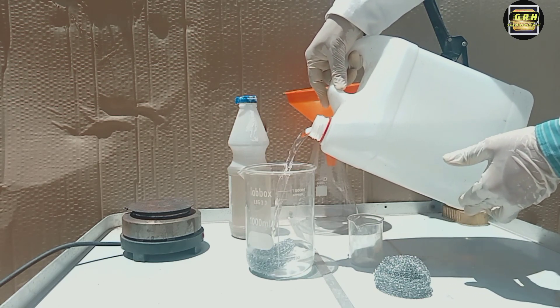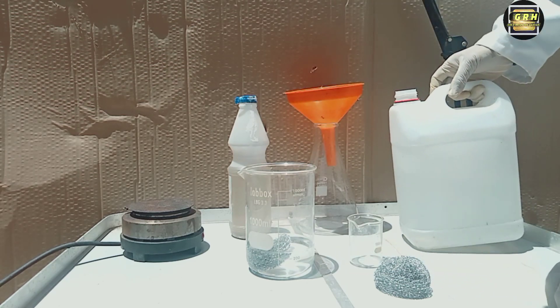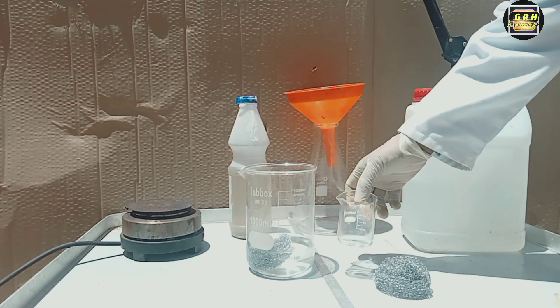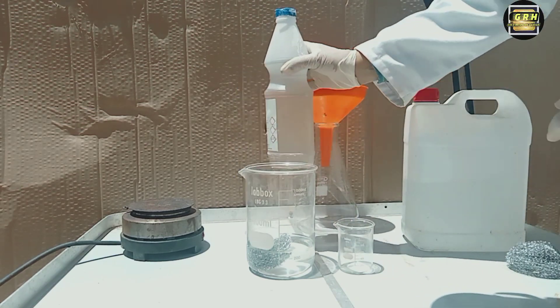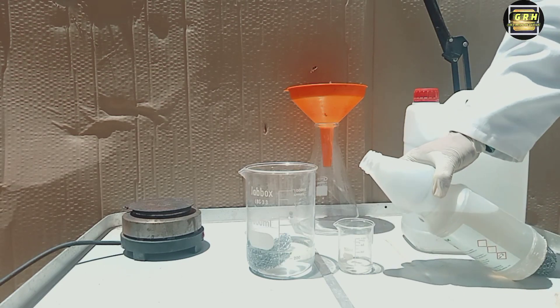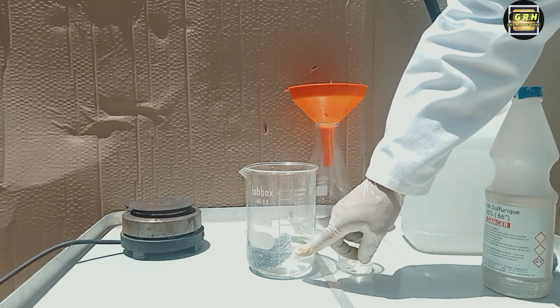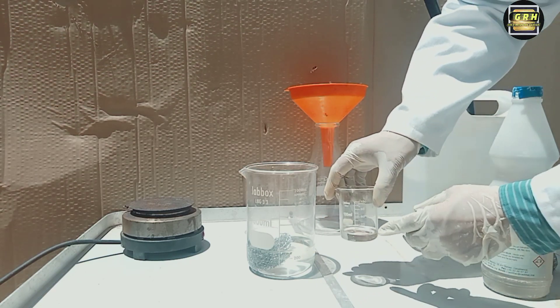Carefully pour a solution of dilute sulfuric acid in water over this material — 1 part acid to 15 parts by volume of distilled water. When mixing acid and water, never pour the water into the acid. Always pour the acid very carefully into the water. For example, I use here 300 ml distilled water and 20 ml sulfuric acid at 96%.